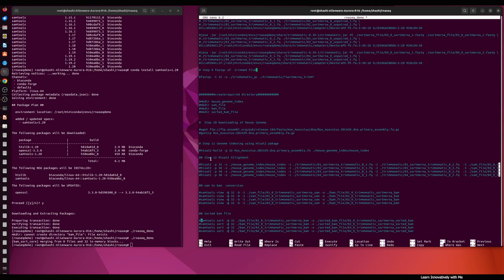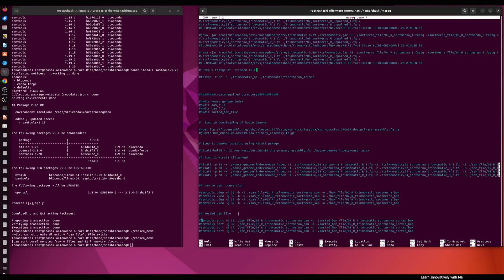I have shown you how to download the reference genome, create the index file using HISAT2, perform alignment using HISAT2, convert SAM to BAM using samtools view, and sort the BAM file using samtools sort. I hope this will help you in your journey of RNA-seq data analysis.